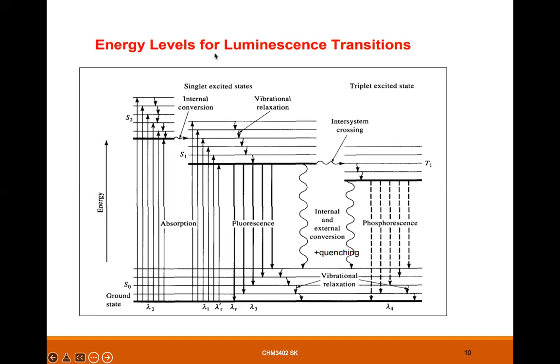Okay. How's the phosphorescence and fluorescence being produced? Okay, now let's talk about the electron here. So the electron here is at ground state. And here S1 represents the excited electronic level.